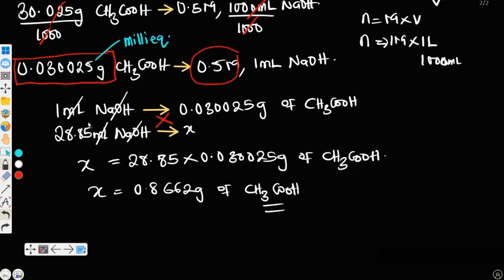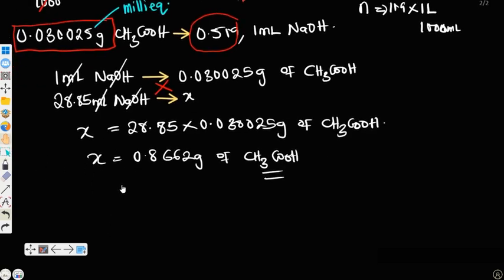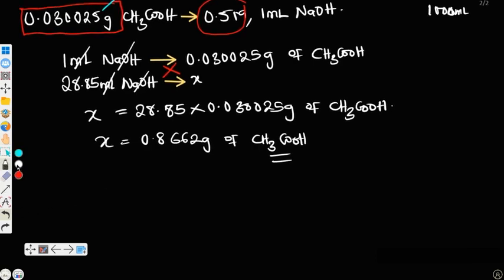Now, this is one way to solve it. But the one that you have in your manuals and the one that we'll be following is the one where we say the experimental weight or the calculated weight is equal to calculated weight.